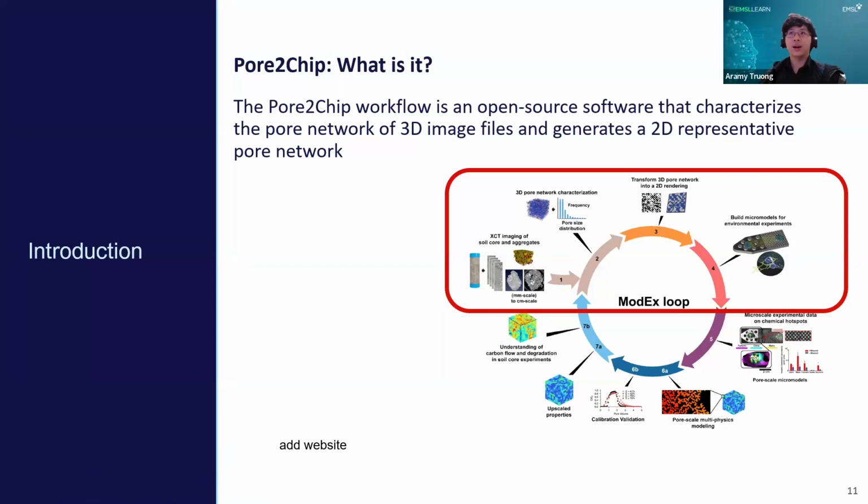So thank you, Erin. I'm Aramy Truong. I'm going to talk generally more about the technical aspects of Pore2Chip, either how to make a micromodel on your own system or to approach us at EMSL to have your soil core analyzed and a micromodel made here in our laboratory. So what exactly is Pore2Chip?